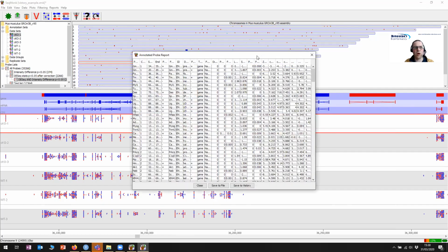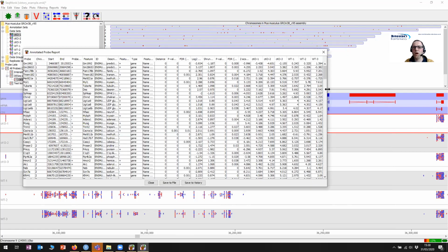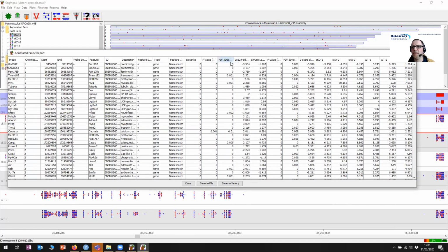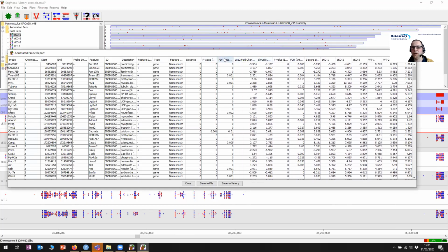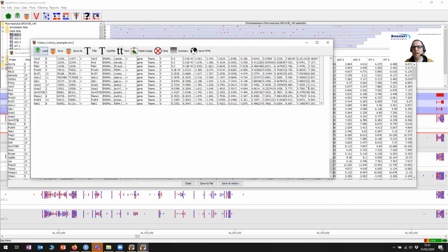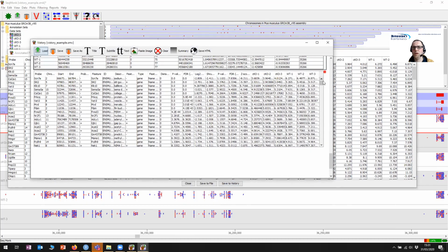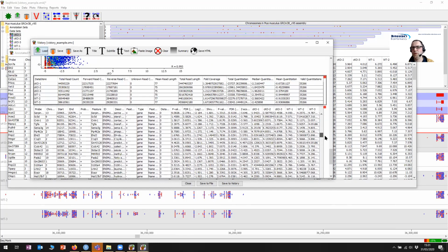So now I'm getting my list of 256 different genes, but within here, I've got the DE-seq hits here, and I've got the intensity difference ones here, and all of those will end up on here. So if I sort these by the DE-seq and then I save this into the Vistory, then in my report on here, I'll see now it's got too big to fit into the table, so it's got a little individual scroll bar that it can produce.